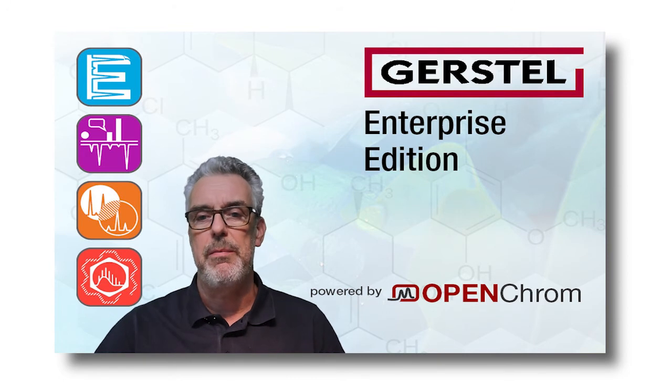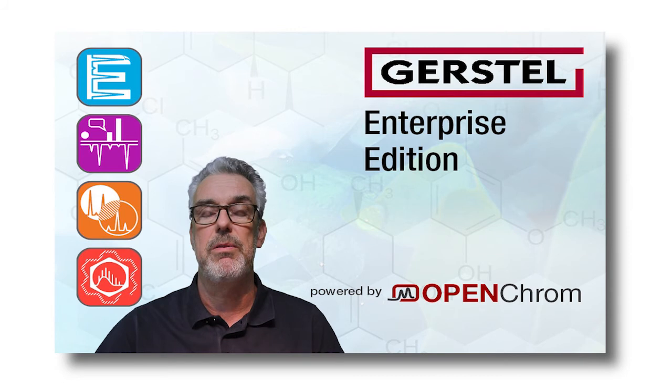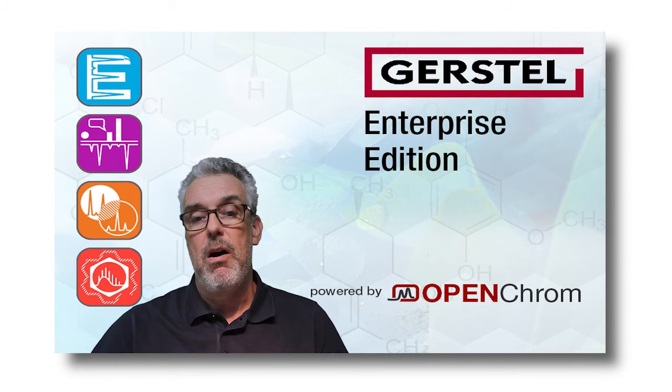This software enables you the determination of even minor amounts of polymer material and other compounds in complex samples through intelligent matching with library or database data on pyrolysis breakdown products.